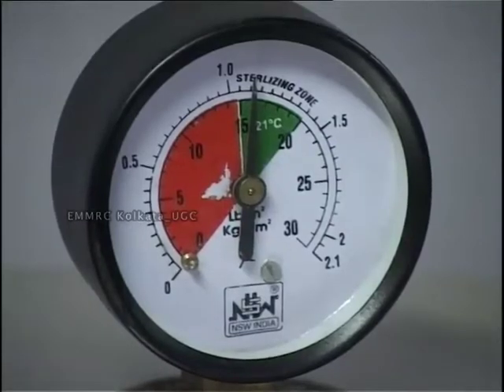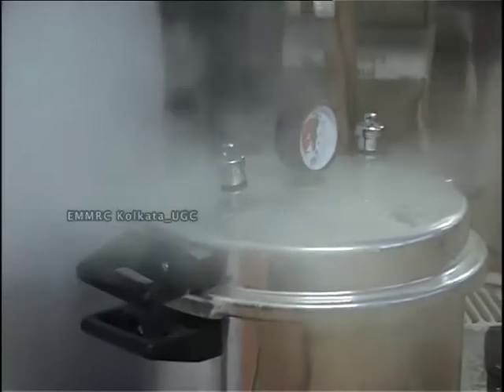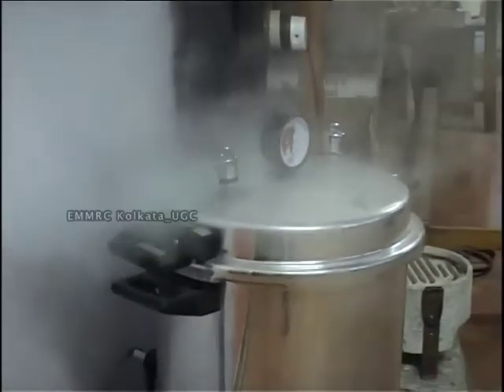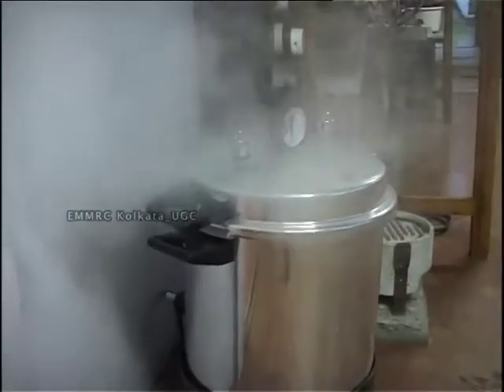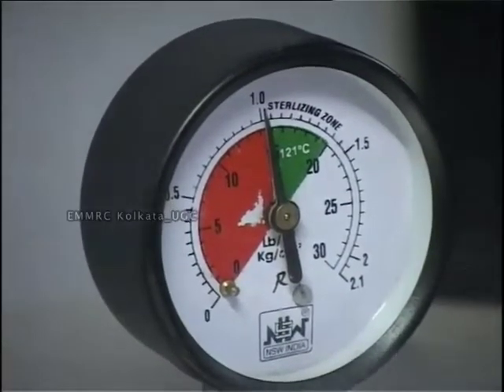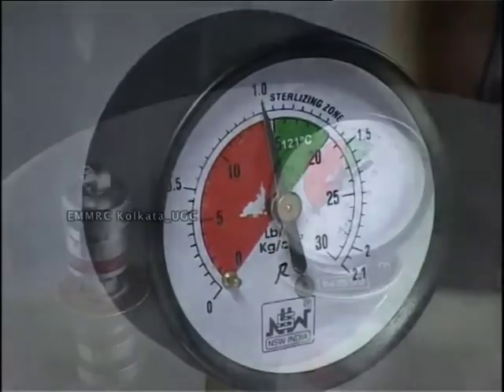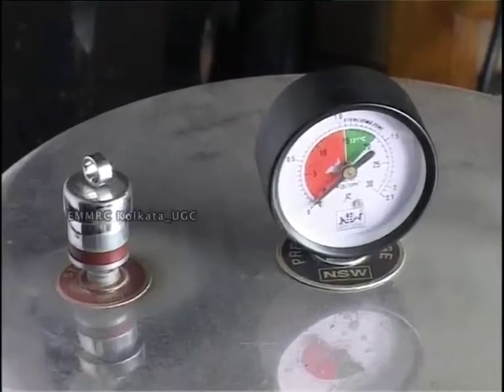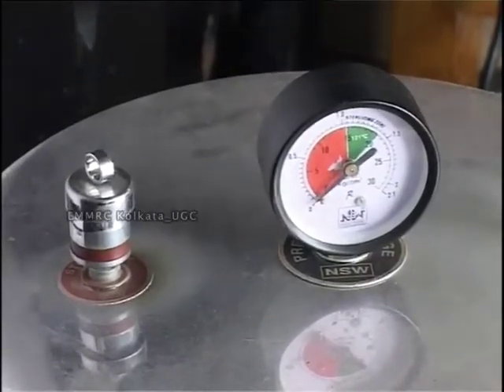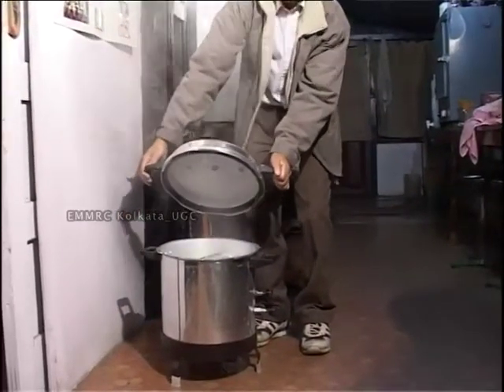When the indicator reaches the sterilization zone, the temperature inside the autoclave is very high, which kills all the germs. The autoclave should be kept boiling for about 15 to 20 minutes, even in the sterilization zone. The autoclave should be opened only when the indicator falls to 0 degree, as the pressure is so much. This is the correct way to open the lid.